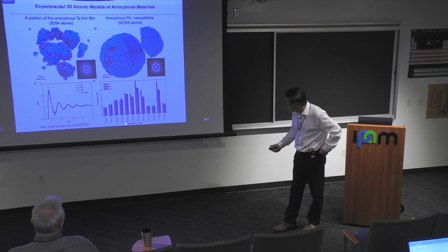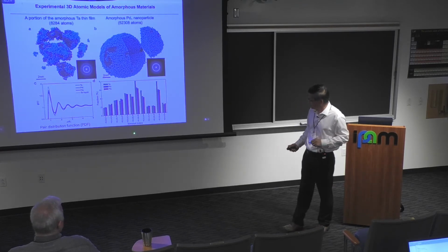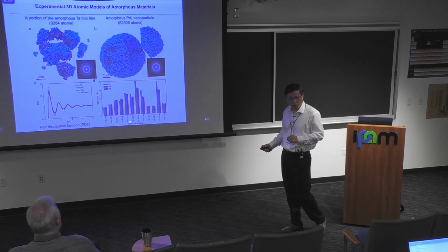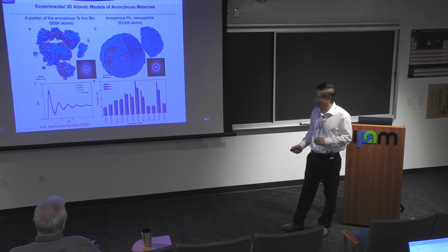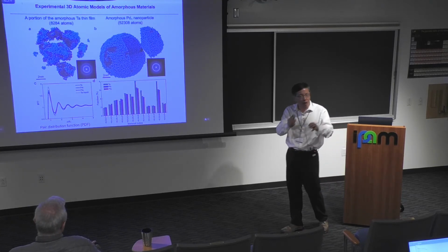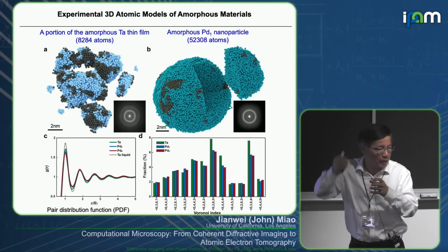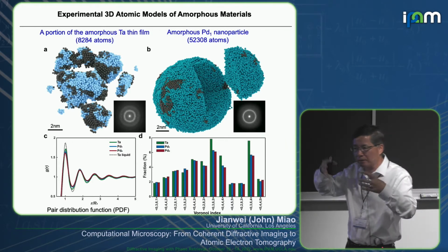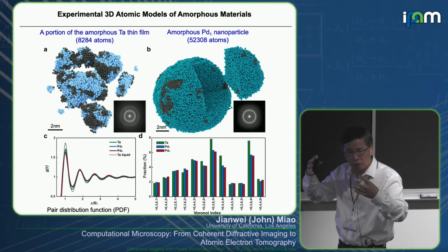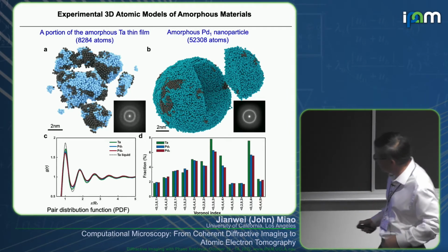And then we also did a Voronoi index analysis. Everybody has heard about the war in Ukraine. Georgy Voronoi was a Ukrainian mathematician. He passed away, but he developed a method to find the short-range order, the atom and its neighboring atoms. So he found the atom and its nearest atoms, and how to find the geometrical arrangement. It's called a Voronoi index.